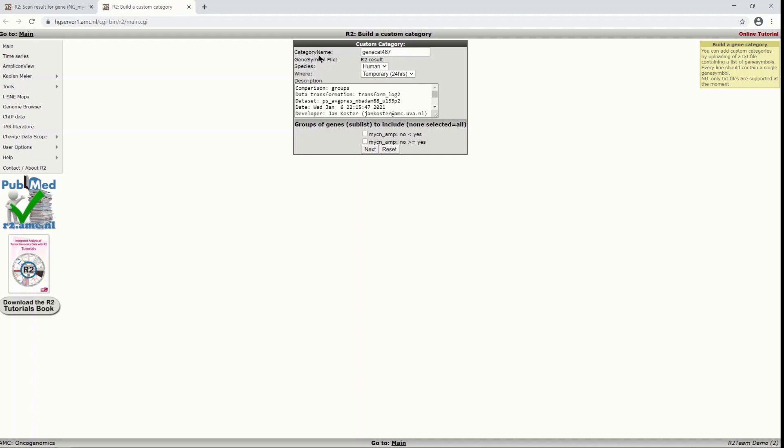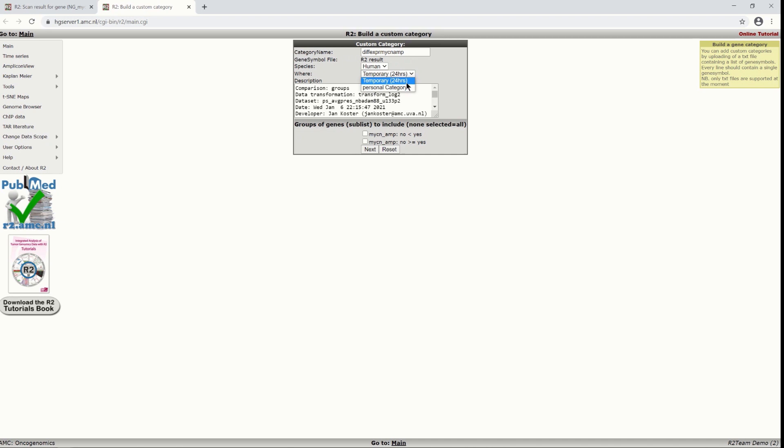There's always already a default name created for you. But let's say your diff expression MYCN amp. Here it is set to temporary 24 hours. If you want to keep the analysis for longer, then you can just put it as a personal category and you can find it here on the right hand side.